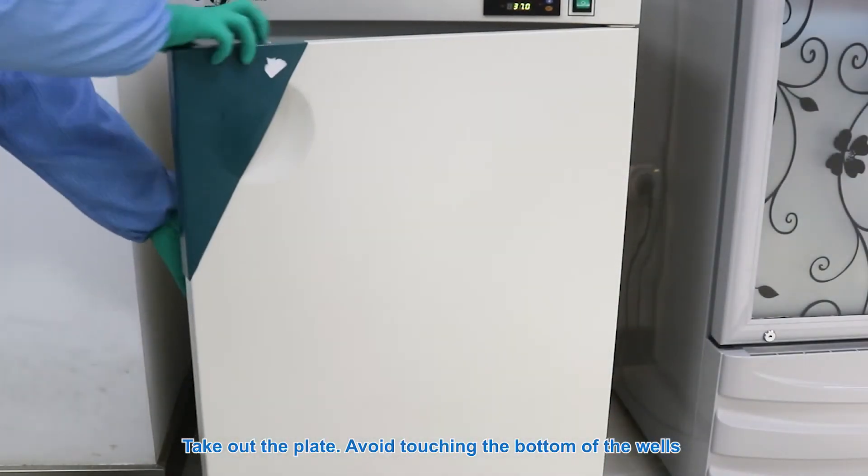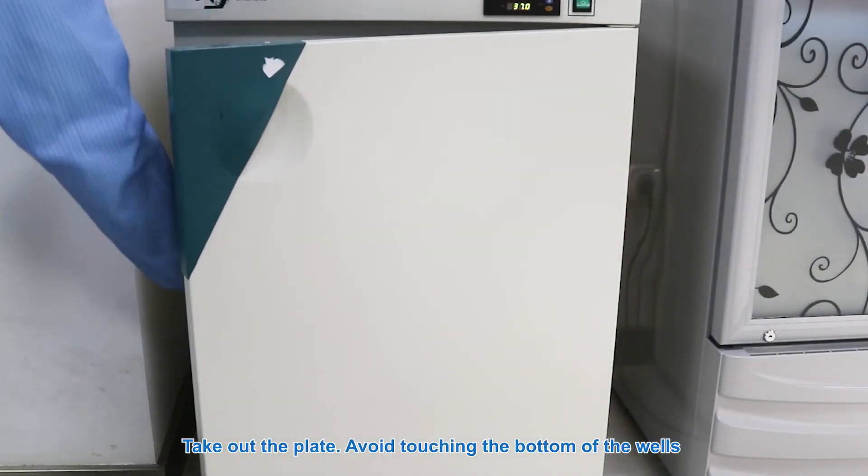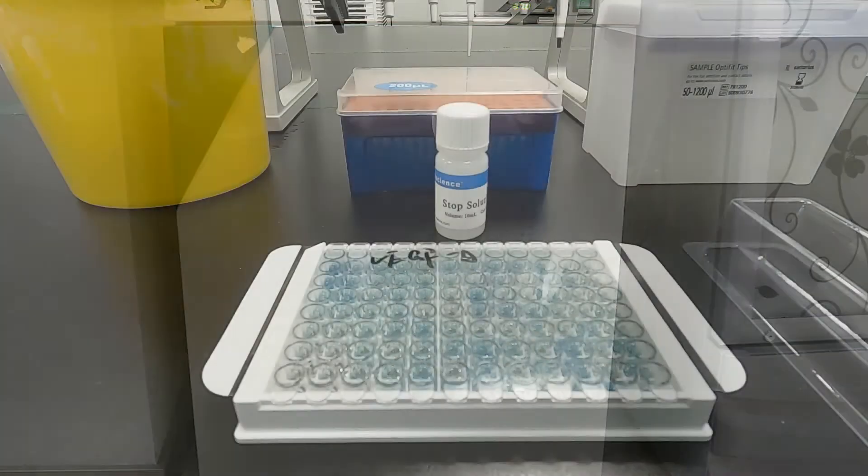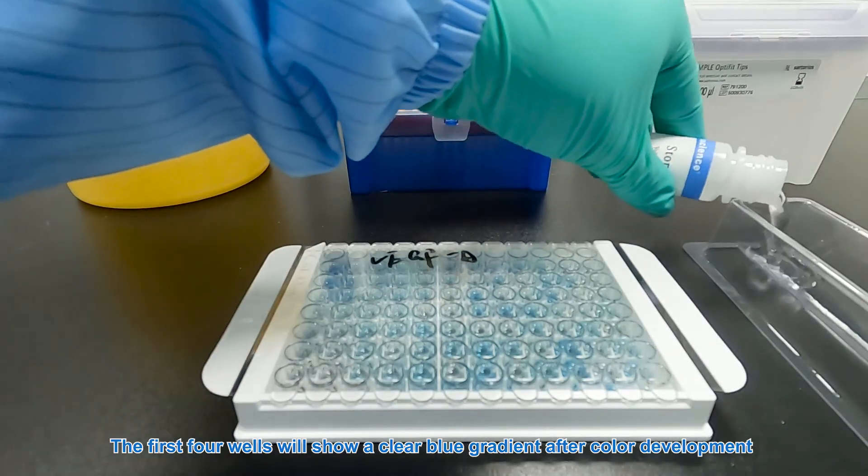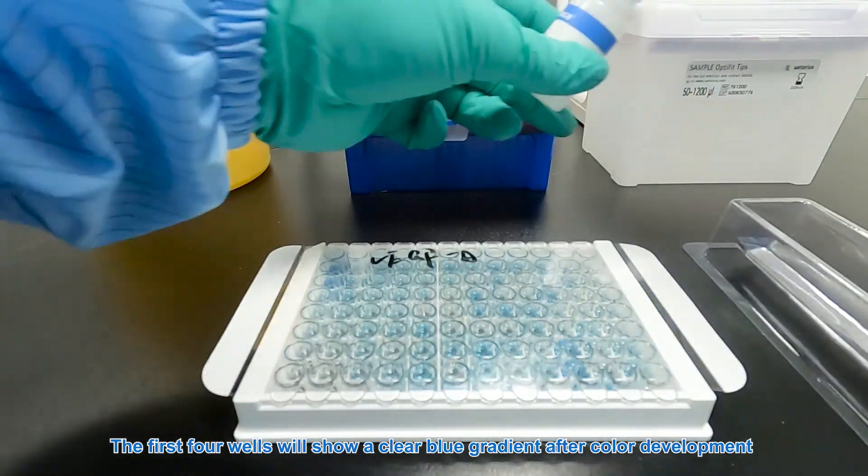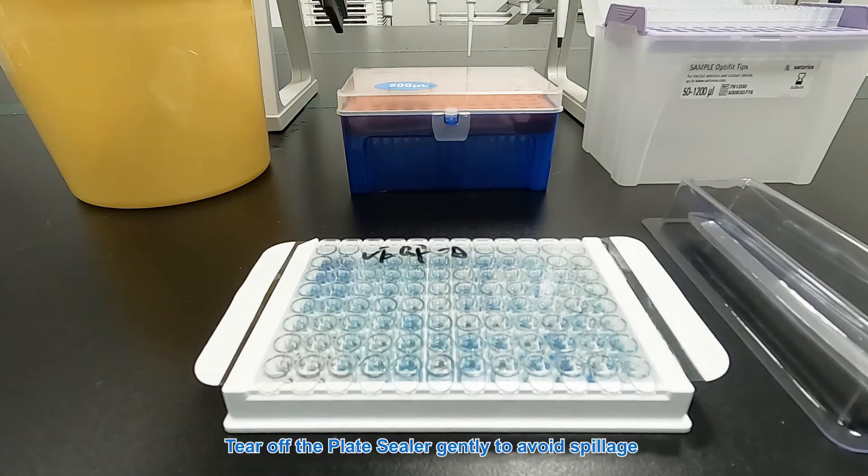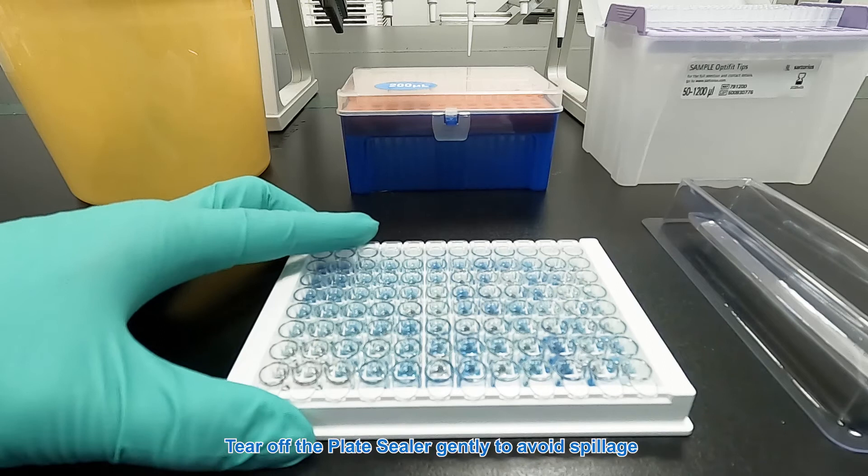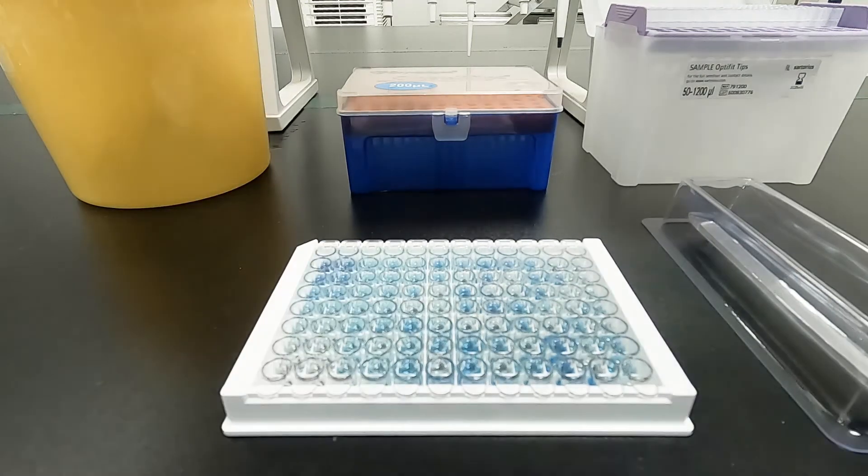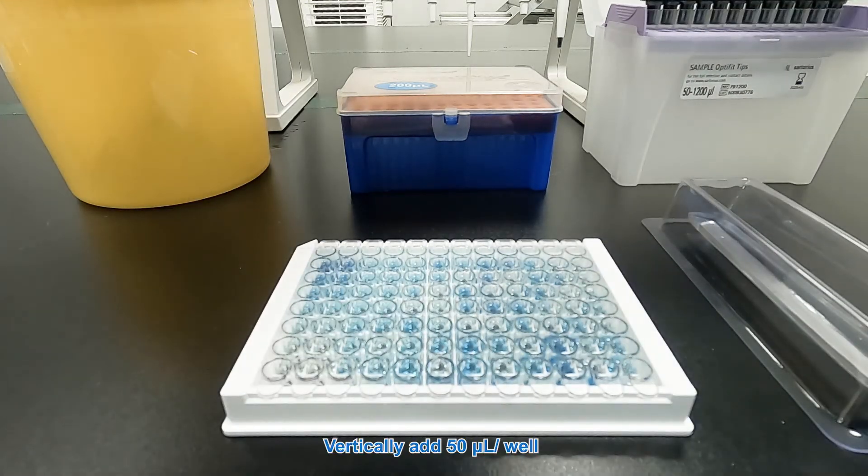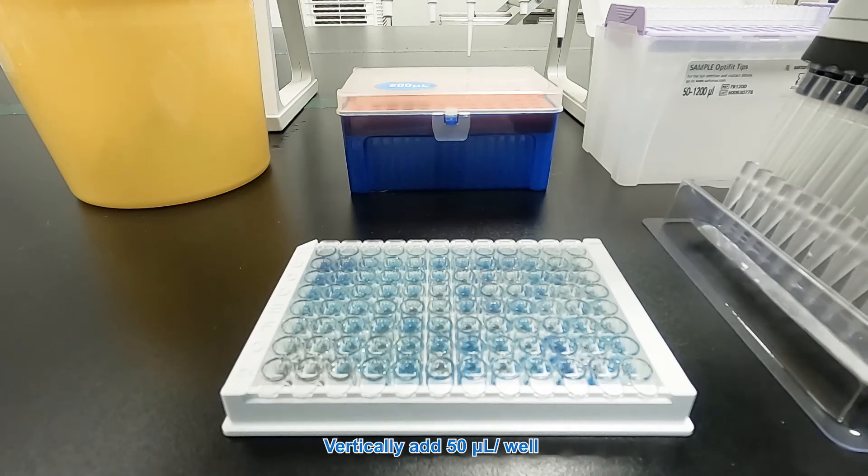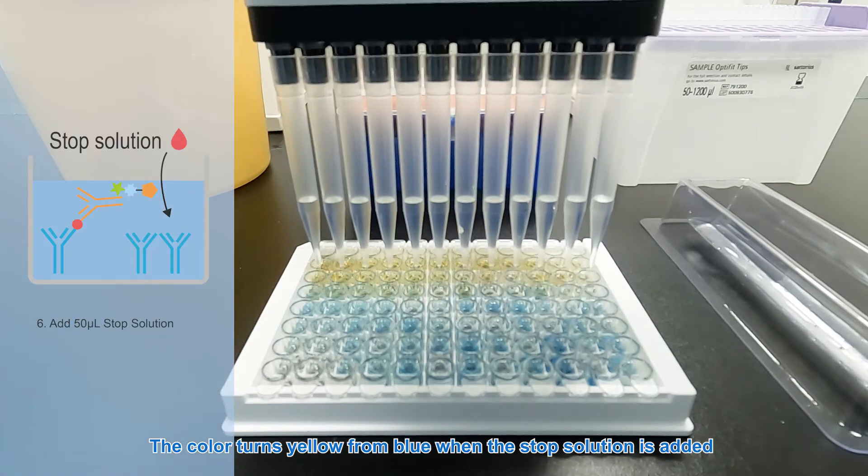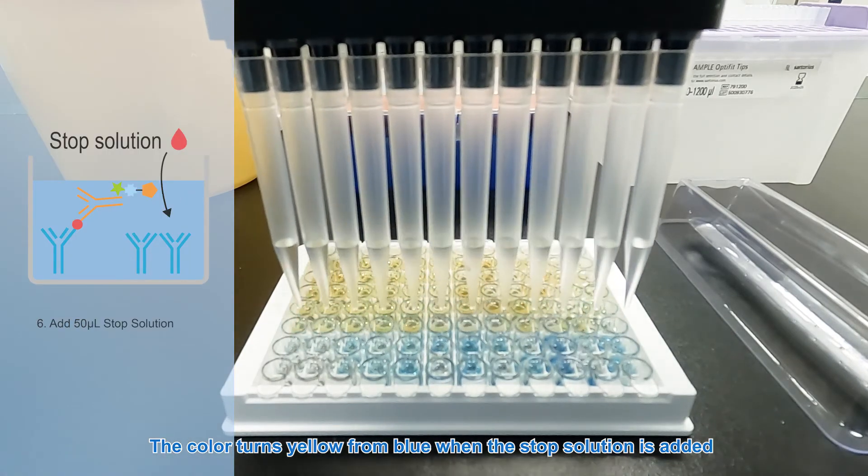Take out the plate. Avoid touching the bottom of the wells. The first four wells will show a clear blue gradient after color development. Tear off the plate sealer gently to avoid spillage. Vertically add 50 microliters per well. Color turns yellow from blue when the stop solution is added.